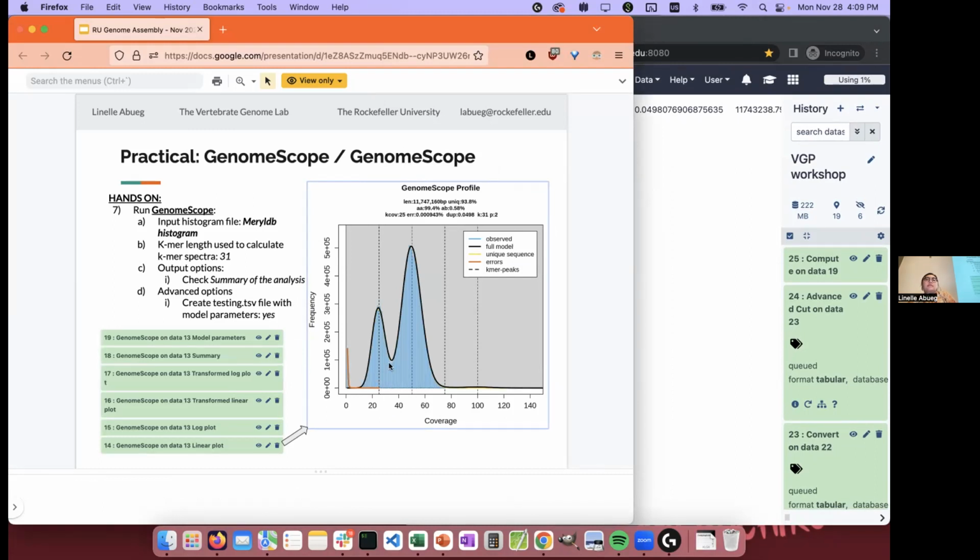It's also used with the coverage, because 1.5 is actually a transition. So 1 would be haploid, 1.5 is between haploid and diploid, and diploid would be 2. When mapping the reads back to the genome, that's where it cuts off between haploid and diploid based on coverage. It might make more sense when you get to the actual purging. Sorry, there's another histogram later on.